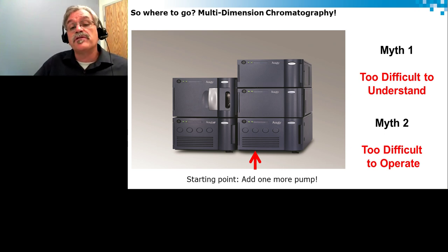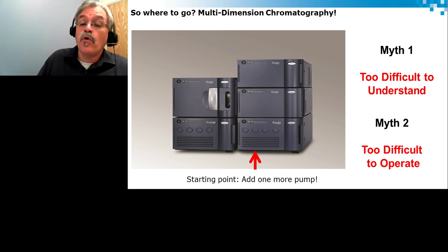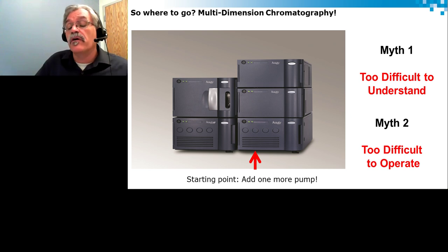And this presentation is actually designed to give a heads up as to what is out there, what we would need to go, and some of the benefit of actually adding extra units. In this case over here, entry-level multi-D would be as easy as adding one extra pump. If we want to go further, go ballistic, then yes, we can actually add more components. It becomes more complex, but with today's software, everything can be controlled.